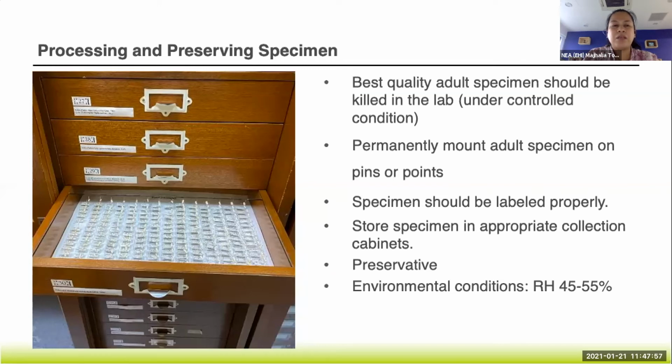So that means at certain points they will be attractive to ants. So it is also good that your drawers are airtight and ants cannot go into them. But we still put mothballs to prevent further degradation, or at least avoid the chance of them getting degraded.